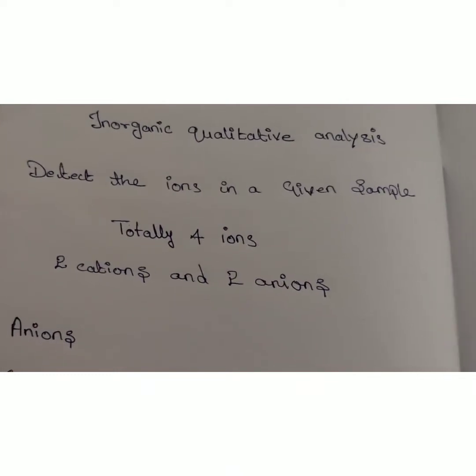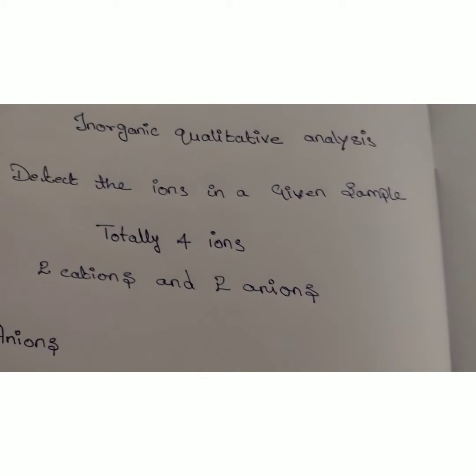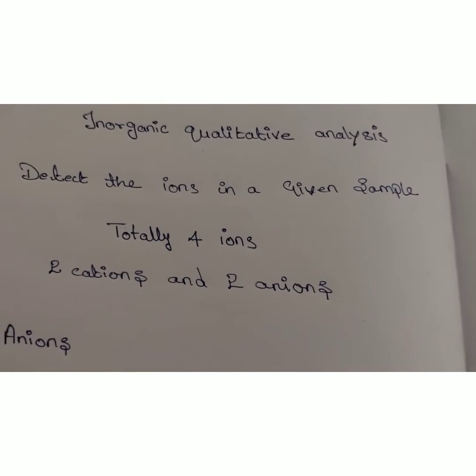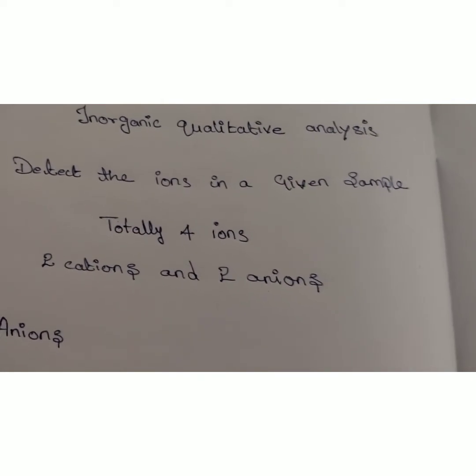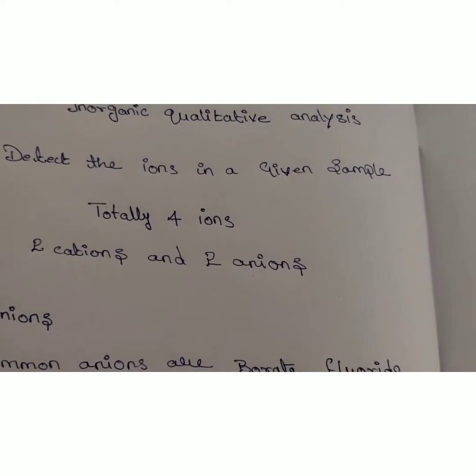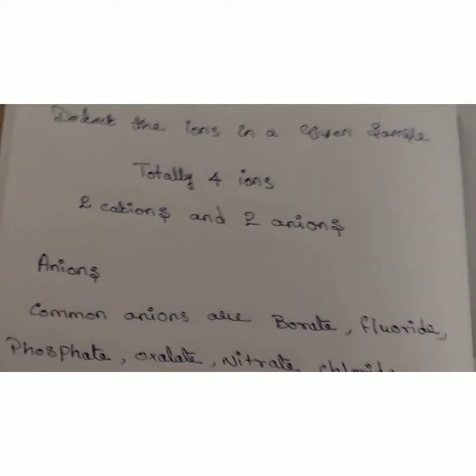Today we are going to discuss a practical class, that is inorganic qualitative analysis. In inorganic qualitative analysis, we are going to detect the ions in a given sample. Totally we are going to detect 4 ions, that is 2 cations and 2 anions. First, let us see about anions.